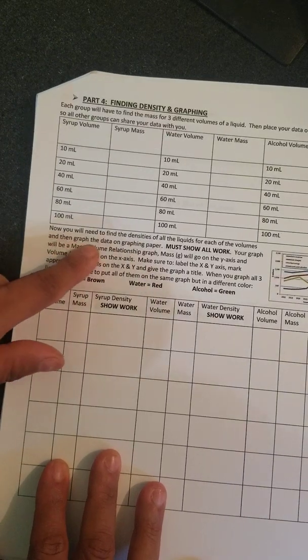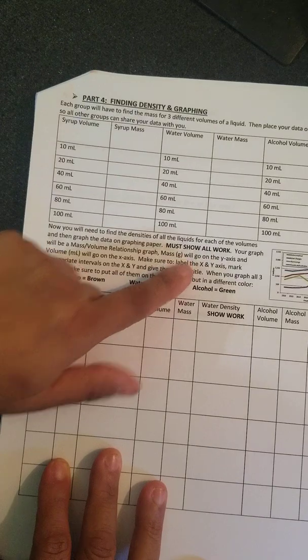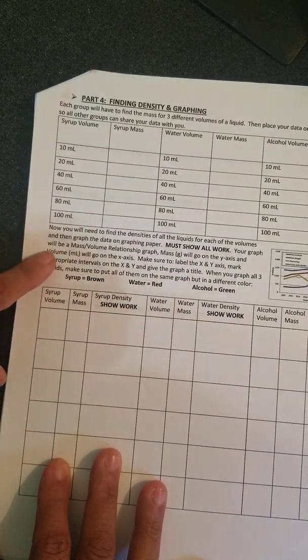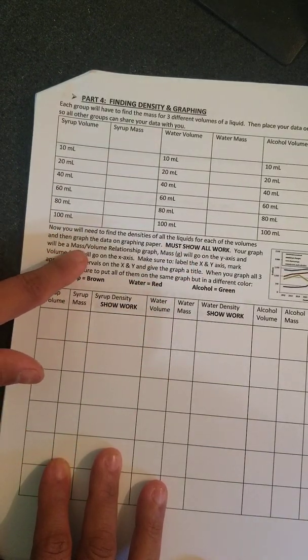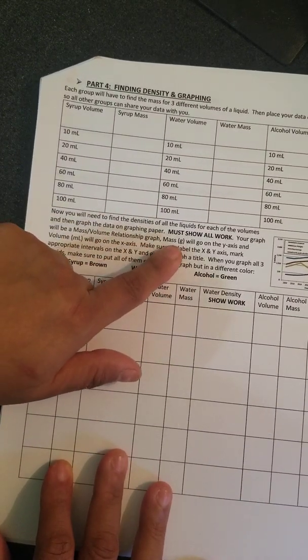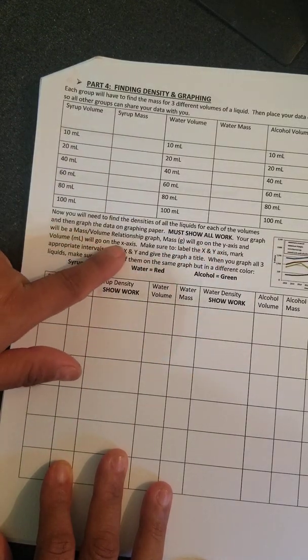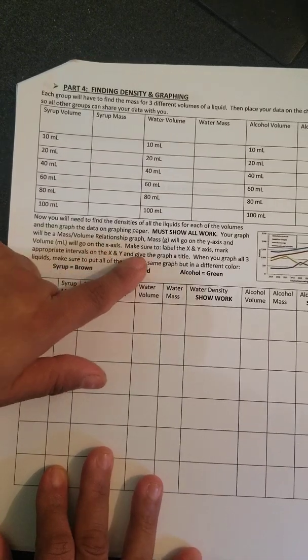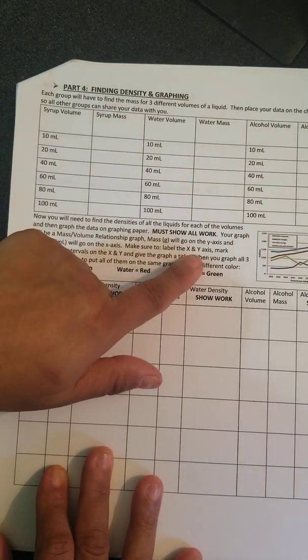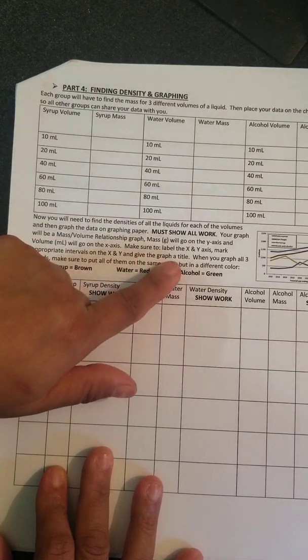It says here, now you need to find the densities of all the liquids for each of the volumes and then graph the data on the graphing paper provided. You must show all your work over here, your math. Your graph must be a mass per volume relationship graph. So in this case, your mass, which is in grams, will go on the y-axis, and your volume, which is milliliters, will go on the x-axis. Make sure to label the x and y-axis, mark the appropriate intervals on those axes, whether you're going to go by tens or fives or whatever, and give the graph a title.